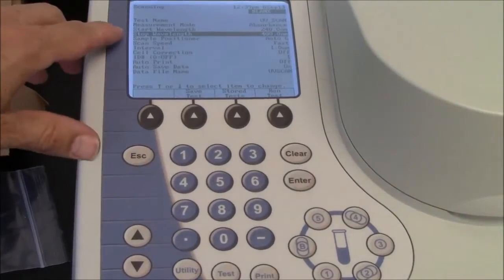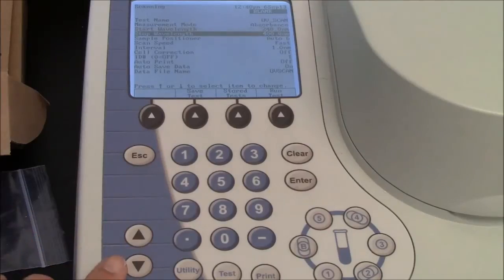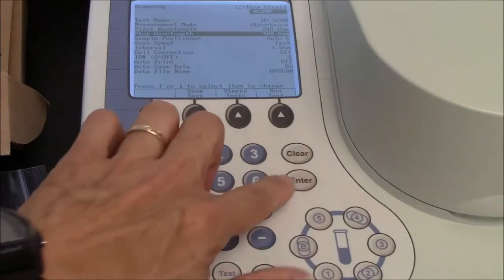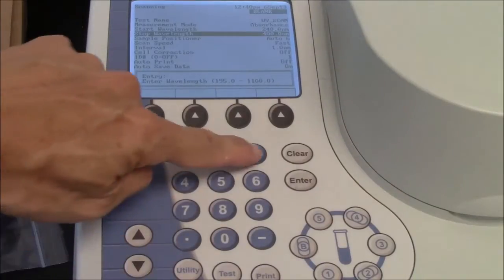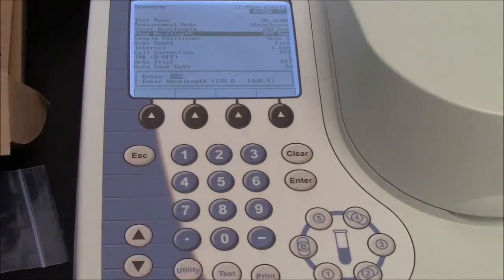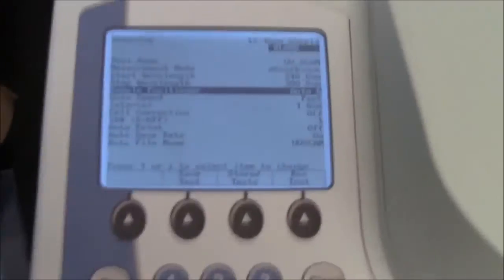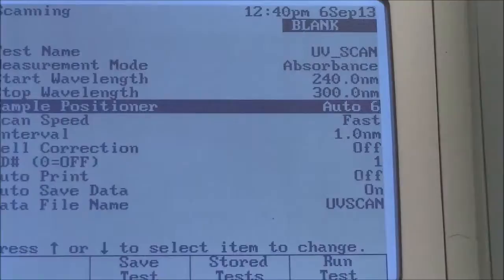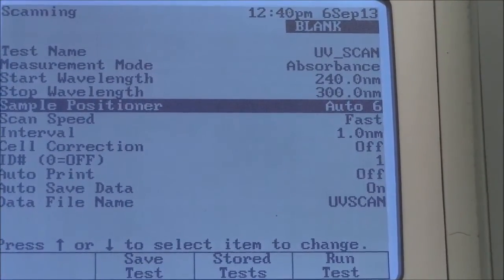I can similarly set the stop wavelength. Use my arrow keys to highlight the choice. Hit Enter. Type in a value. In this case, I'll type in 300 nanometers. Hit Enter. It is set to scan the wavelengths between 240 and 300 nanometers.